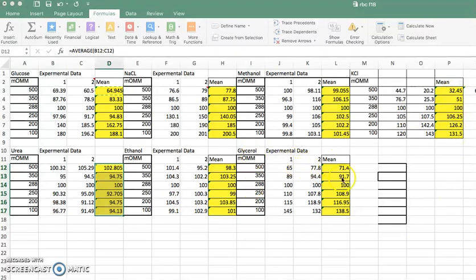Now glycerol is interesting. It's allegedly permeable, but for this experiment in the last few semesters, it hasn't been permeable. It's a big clunky molecule. I bet if we let it sit for about 10 minutes, it would act permeable.